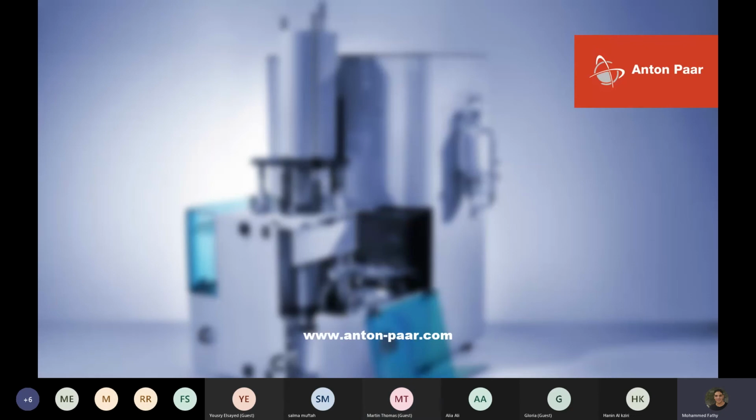Yeah. So after completing the test, how to clean the cell? Are there any remains of mercury? Yes. So you could say the job is half done when we've done the analysis. Now we have to be responsible in how we clean up. So the first step is always to work very close to a fume hood, and always move your penetrometers from the instrument to the fume hood in, let's say, an external container, say, a plastic dish or something.